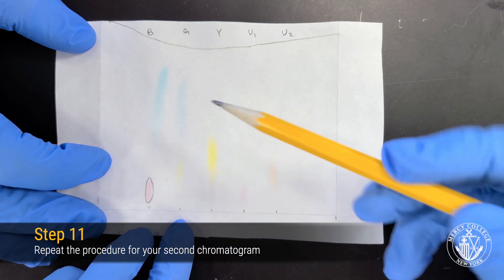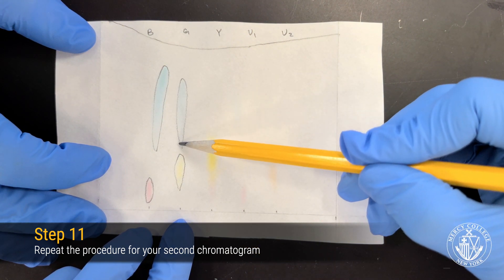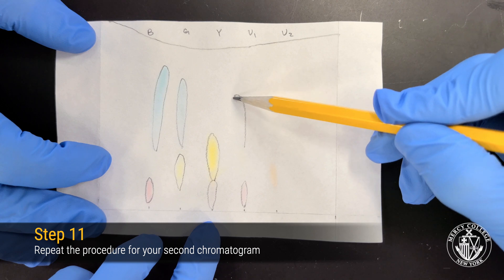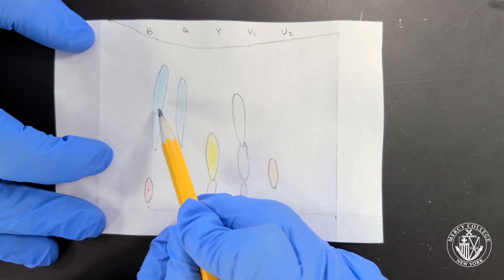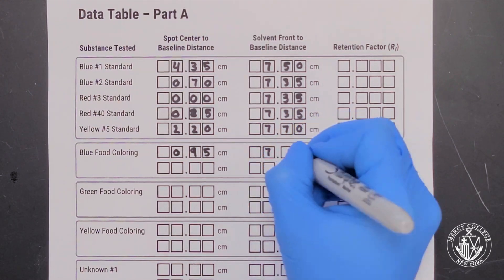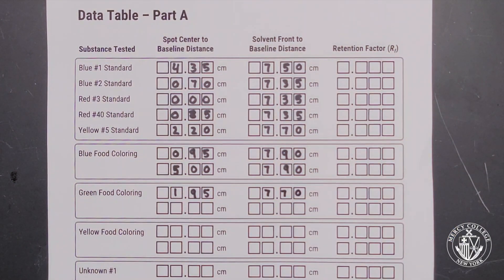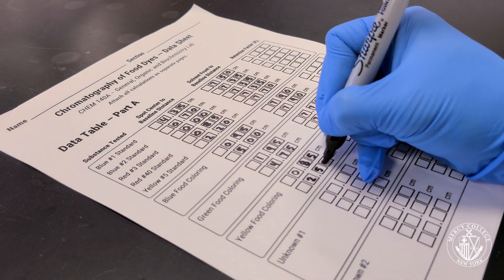Once you've completed this process for your first chromatogram with your five dye standards, repeat the process for your second chromatogram with the five dye mixtures. Unlike the pure dye standards, the mixtures may contain two or even three different substances and may have multiple spots per lane. Be on the lookout for faint spots, particularly with the color yellow. Once you've outlined your spots, go back through and mark the center of each spot before measuring. Remember to measure the distance from the baseline to the center of each spot — there may be multiple spots per lane — and also from the baseline to the solvent front for each lane. Record this in your datasheet for each of the substances on your second chromatogram.